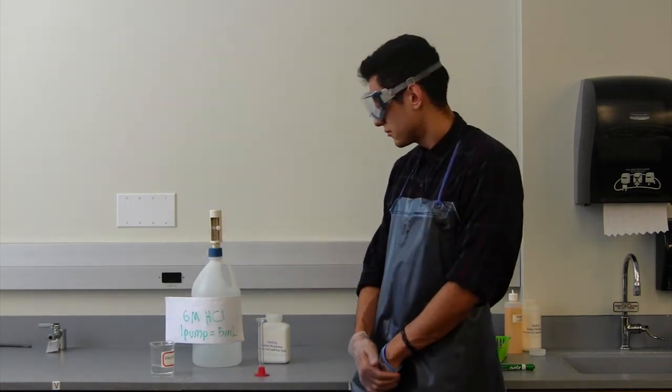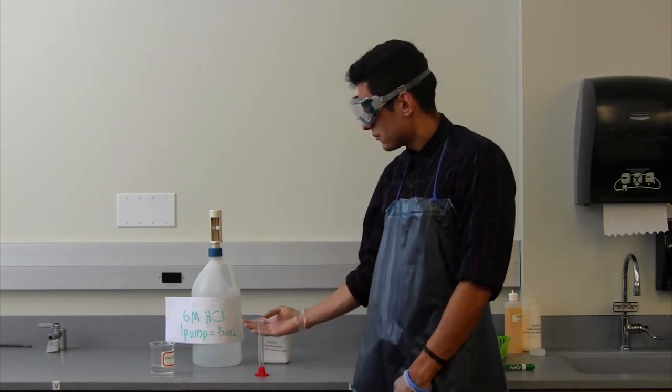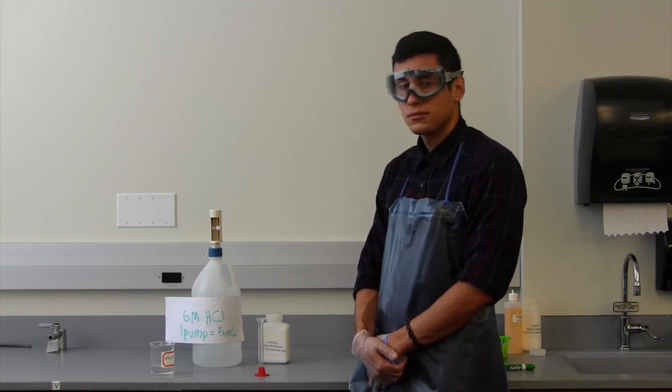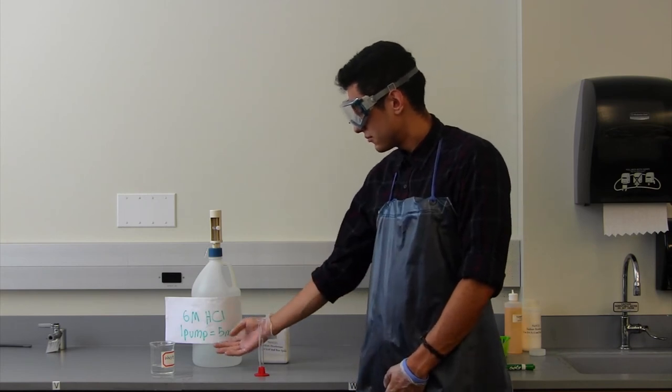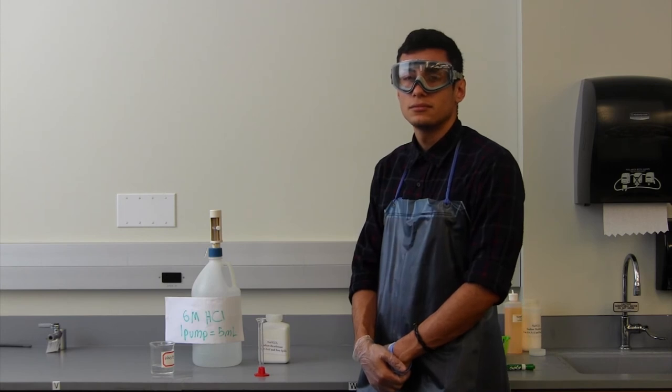The number of pumps will be stated on the reagent pump reservoir, so carefully inspect the reservoir's labels. On this reagent pump, we can see one pump directly specified to dispense 5 milliliters. So perform the pump procedure exactly this many times for correct reagent allocation.